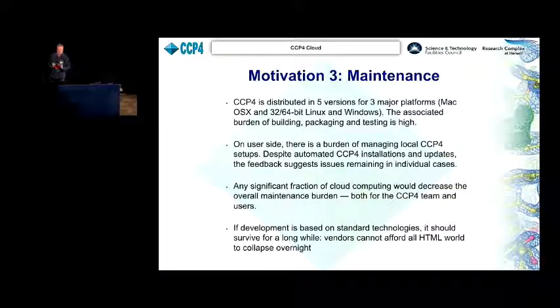So this is a benefit for the CCP4 team, but also for the user. Even if the installation and update of CCP4 have been automated quite a lot, there are still issues in individual cases, and we frequently get some feedback on these on the CCP4 help desk.